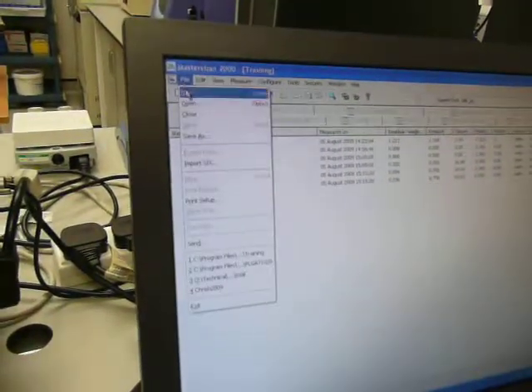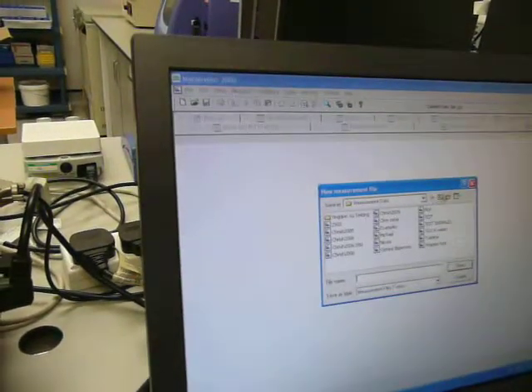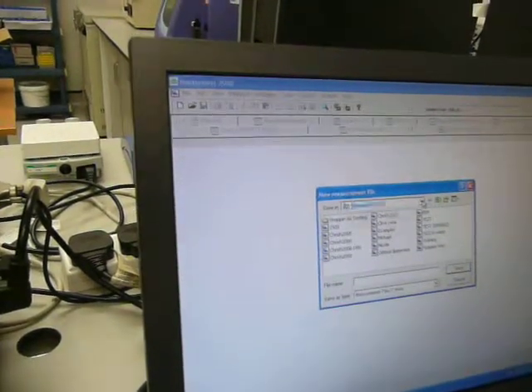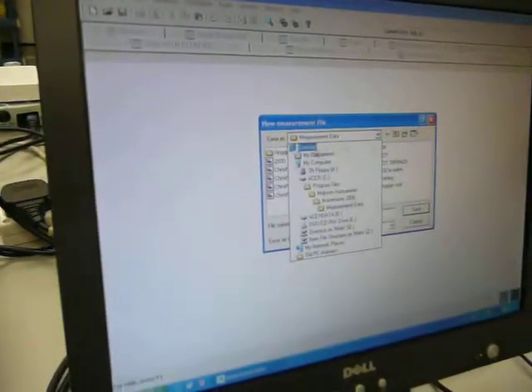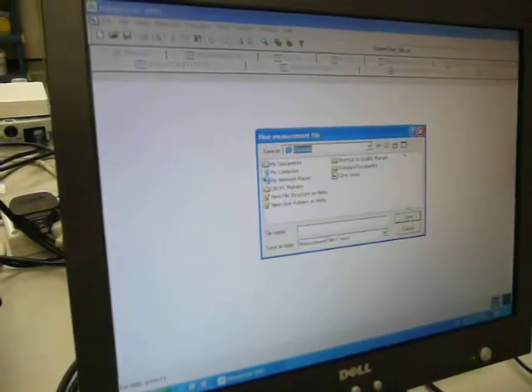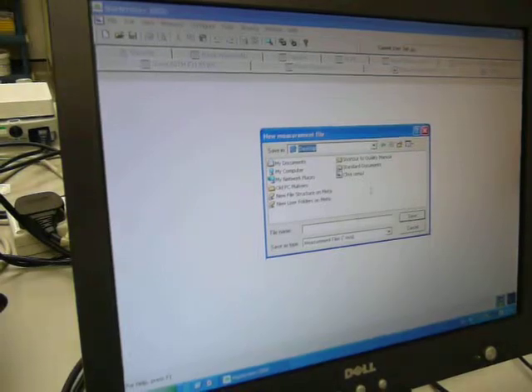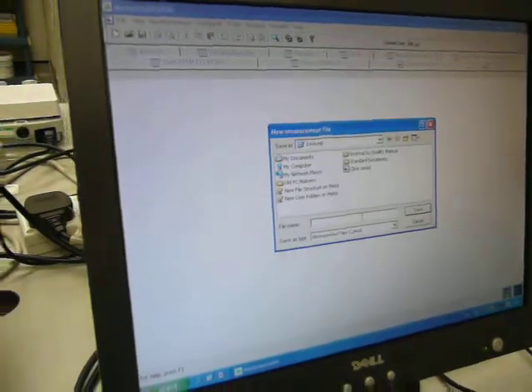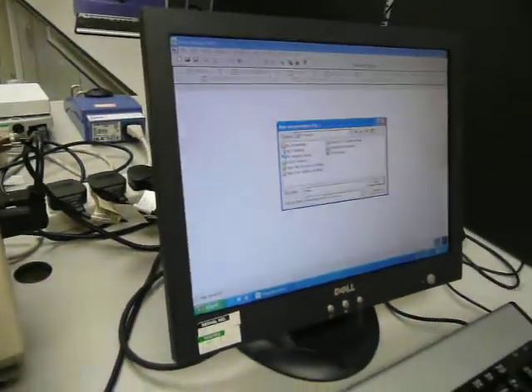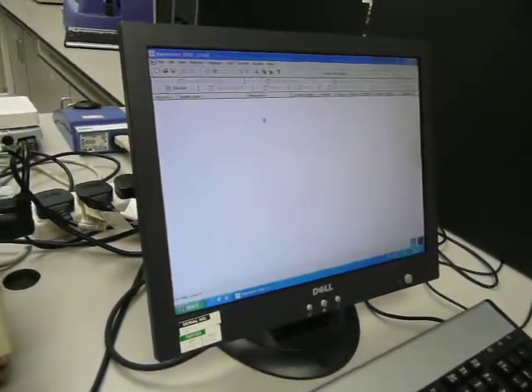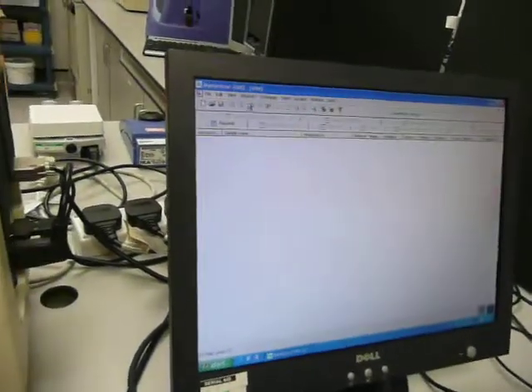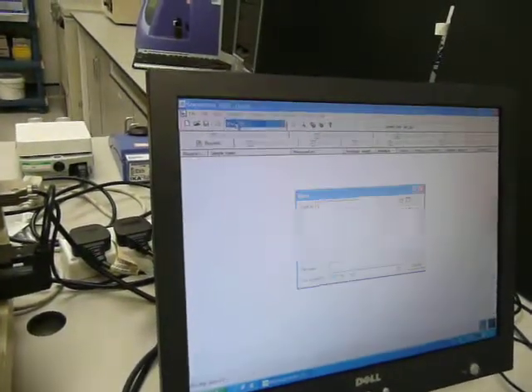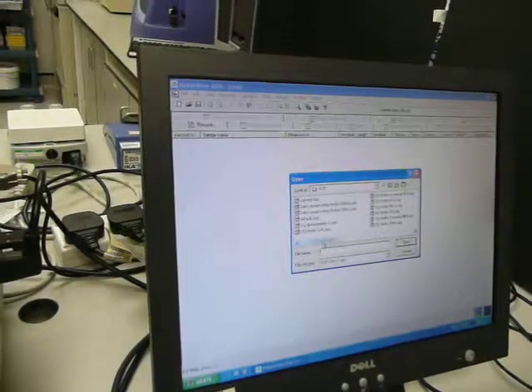So you can start as a new file, just use desktop. So you can start as a new file and then you can start as the SOP, which is used actually in.